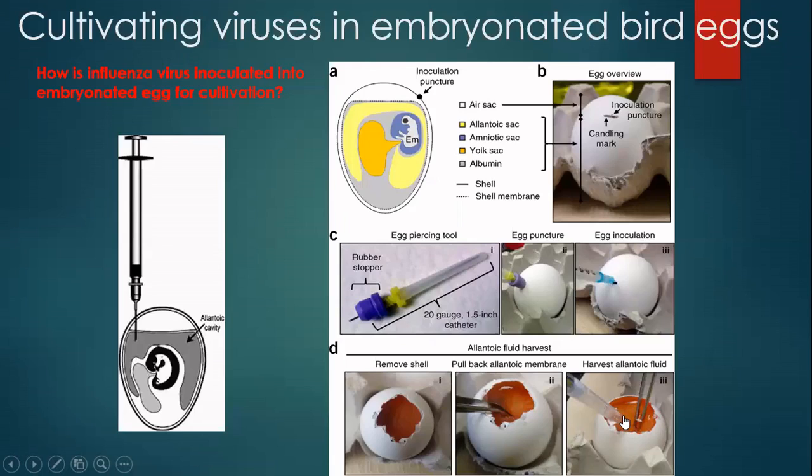And then the harvested fluid can be used for vaccine preparation, after isolation and purification.